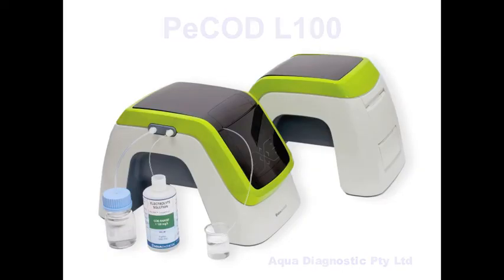This video demonstrates how to use the AquaDiagnostic L100 PCOD COD Analyzer.